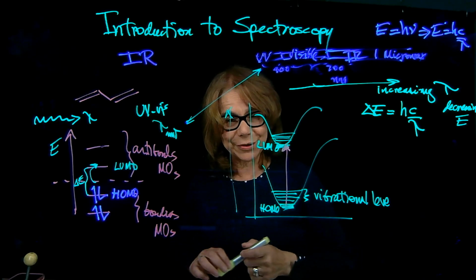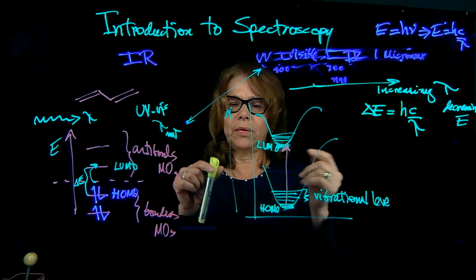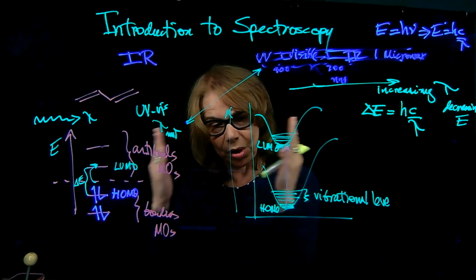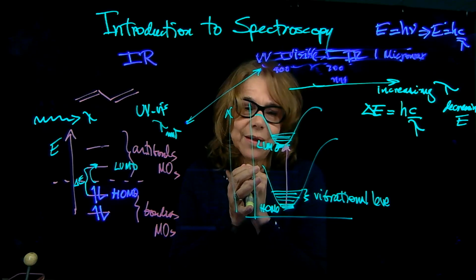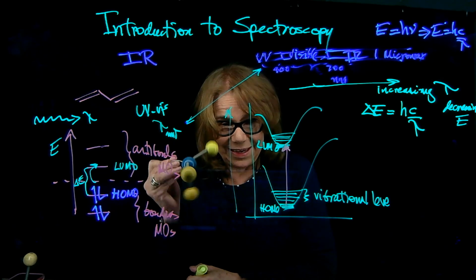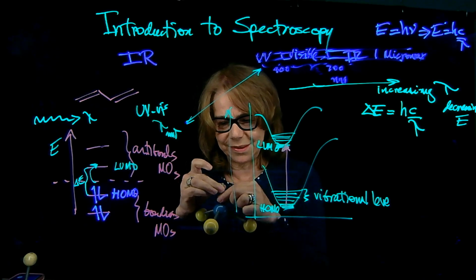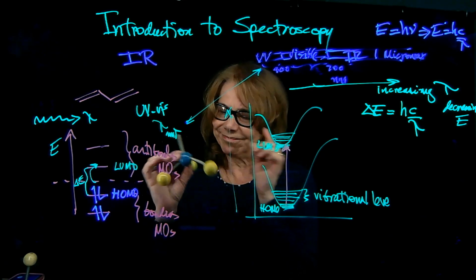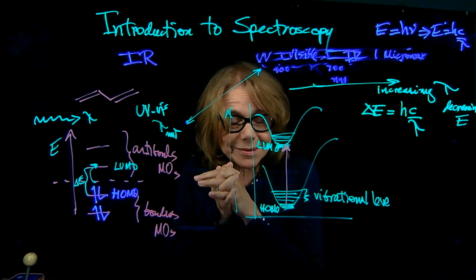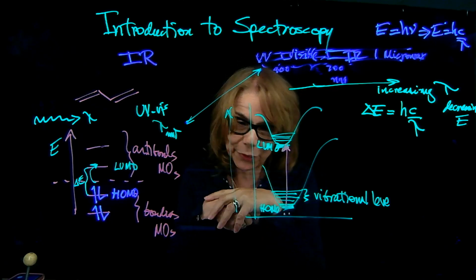So that is the origin, and we will then be analyzing a spectrum using this. The idea in general is electronic transitions for UV-visible, and vibrational transitions that we're going to be seeing, and there are several modes, as we said with our models. I like those models with the springs. This is my lone pair in ammonia. So bonds are not static, there will be those vibrations, and this is the origin of the bands that we have in the IR.